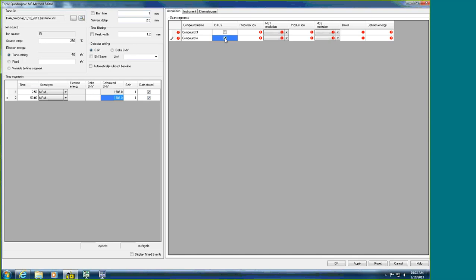The benefit of labeling things here is that when you do your quantitation later on, this particular compound will be flagged as an internal standard already, and this will be from your mass spec acquisition. Okay, so you can set that up in that manner. So as you can see, it's very straightforward, a very clean interface for setting up your scan, SIM, and MRM parameters. You also have the options, of course, to do precursor ion experiments, neutral loss, and neutral gains. So we won't go over that in this particular session.